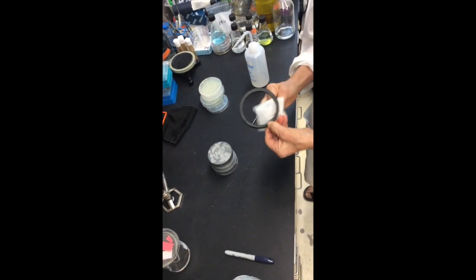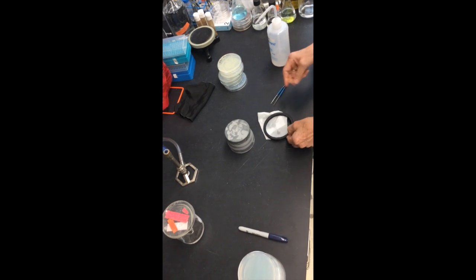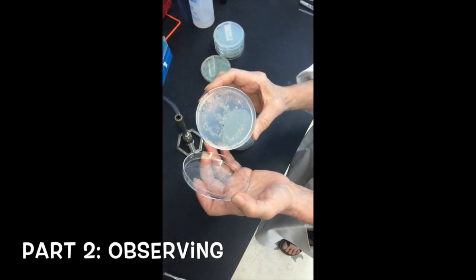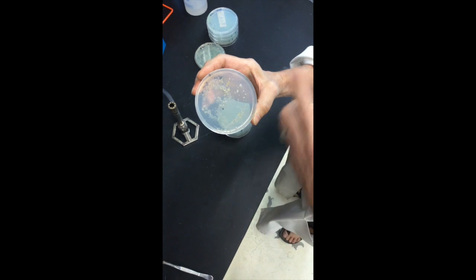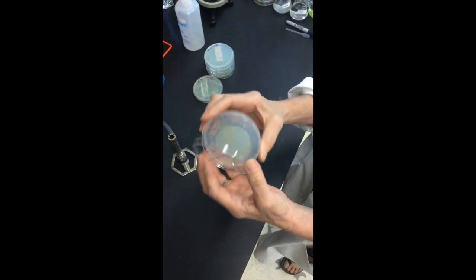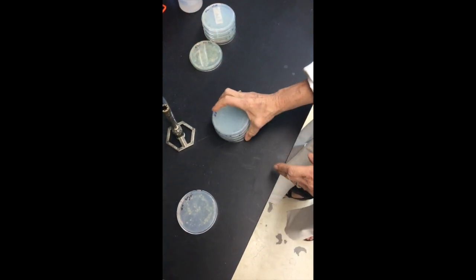clean this off again on the inside. This is the original plate that we spread from a manure sample. And you can see that there are a lot of different types of colony morphologies on here. And then when we did the replica plating, we took the velvet and then pressed it onto this plate. And then we kind of Xeroxed onto 4 other plates.